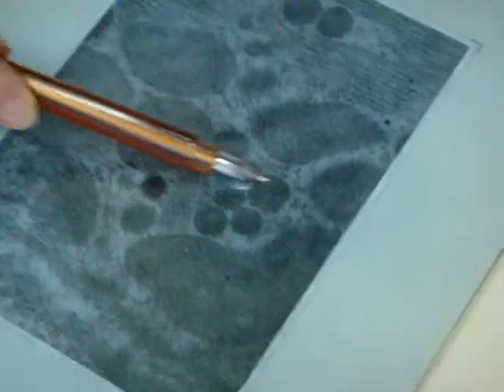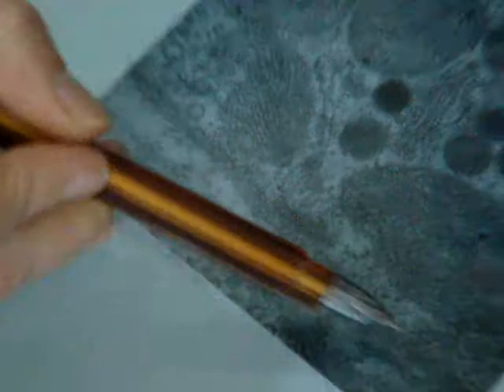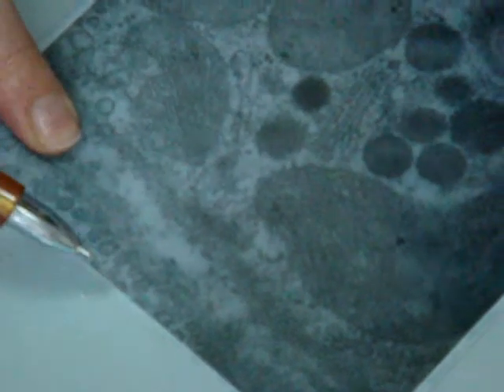Next, let's look again. Again, you can see striated muscle tissue, but because we can see secretory granules, this is cardiac, yes. And look please, this is the membrane, sarcolemma, together with the basement membrane, intercellular space, and another cell. We can see, I think, the basement membrane here and a lot of vesicles. Maybe this is the wall of a blood vessel, transport vesicles.